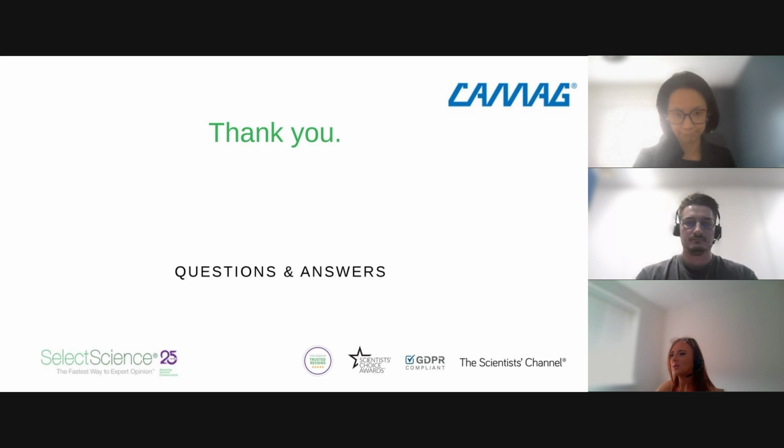That's perfect, thank you. This question is, we see that Nestlé is considering the natural variability of the oil by calculating the acceptance criteria for each peak. Is this something CAMAG is willing to integrate into their software? So it's for me again. Yes, we are thinking about this, to integrate a tool to create a reference pool that is accepted by the industry, and then to calculate all these acceptance criteria that Paul has described during his presentation. So it's something we are working on, and we are discussing that right now.